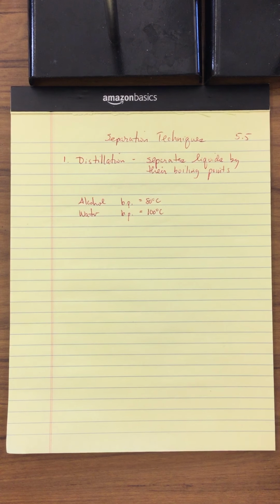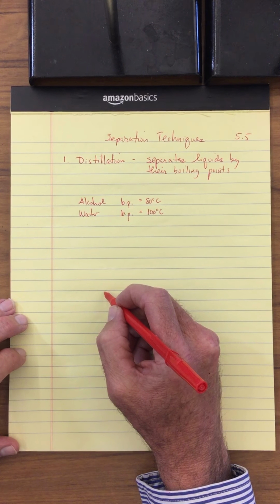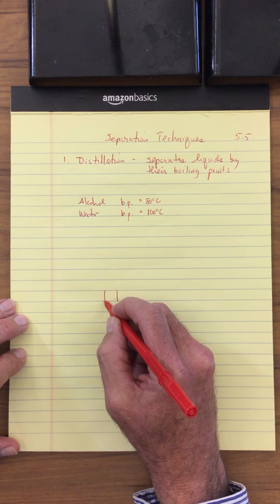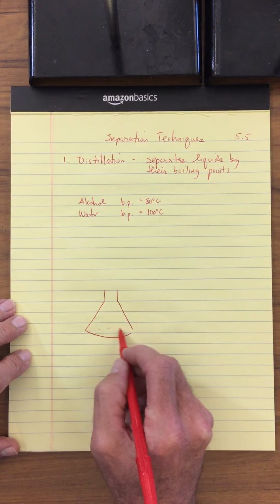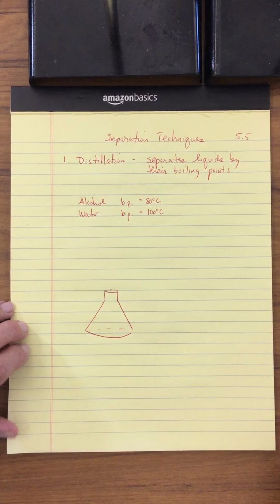Okay, so down below, I'm going to draw a little bit of this process. Imagine that you have a flask, and this flask is filled with the alcohol and water mixture.